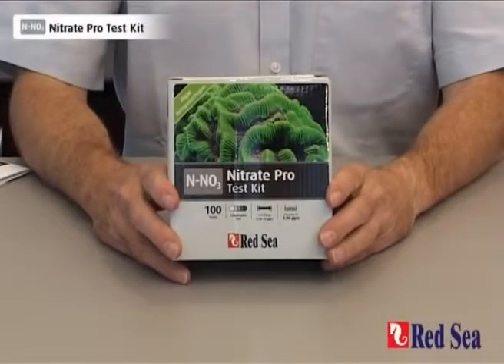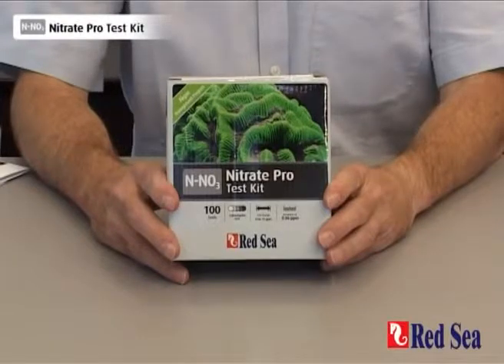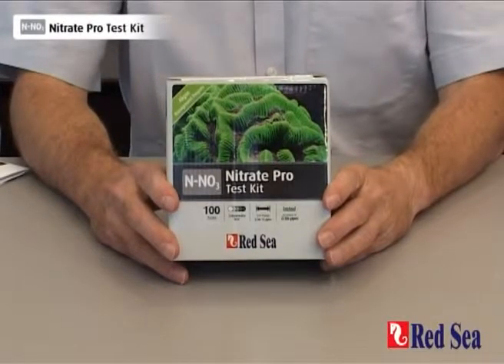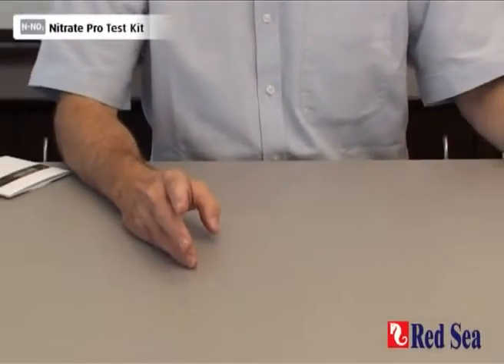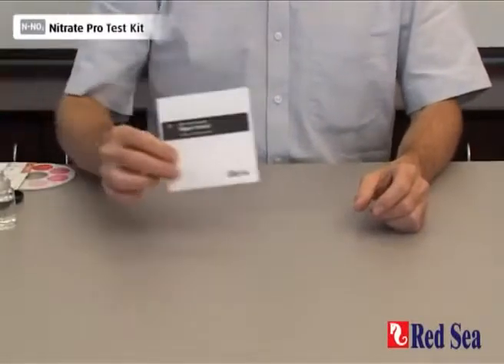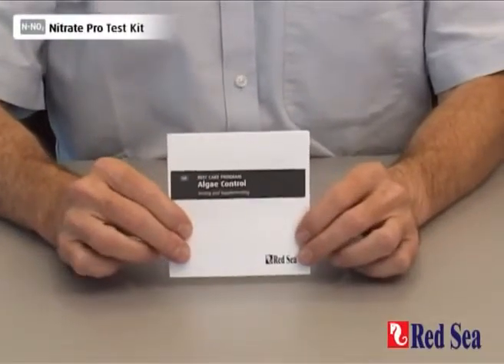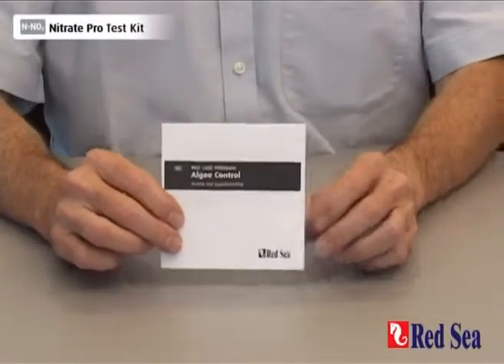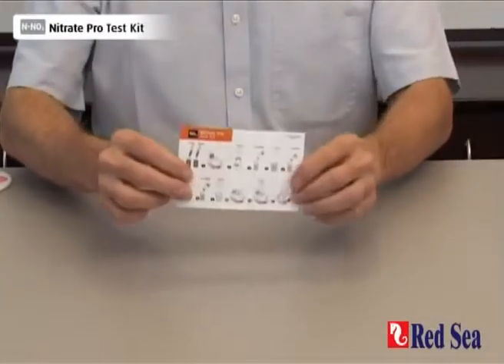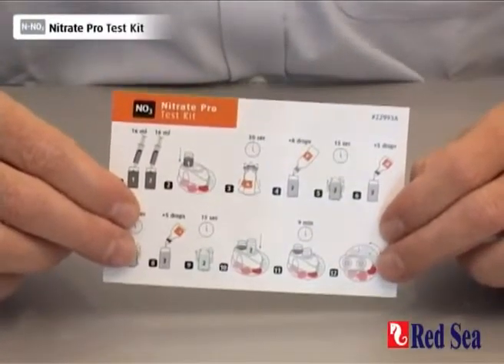Thank you for purchasing Red Sea's Nitrate Pro Test Kit. The purpose of this video is to demonstrate how the test is performed. Before doing the test for the first time, read the detailed instructions in the manual provided with the kit. There is also a set of easy-to-follow graphic instructions for when you're actually performing the test.